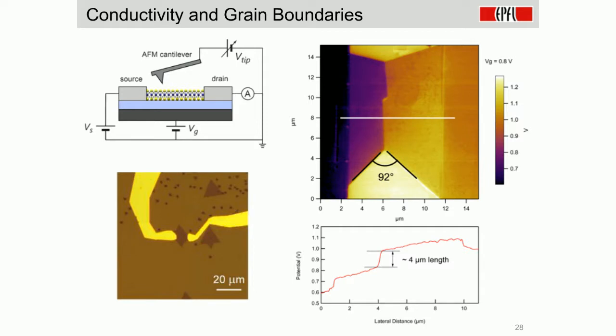We built a field effect transistor, like in the bottom left image, which contains two grains in a certain orientation of MoS2 with electrical contacts. Those are the yellow lines. Then we could load this into the AFM and connect all the electrodes. On the electrical scheme, we use one of the channels on the AFM controller as the voltage source to bias the device and get the current flowing through it. With the gate electrode, which was just connected to the substrate, we again used one of the channels on the output of the controller to modulate the conductivity, making the channel more or less conductive.